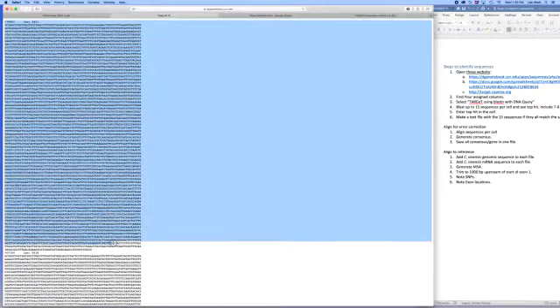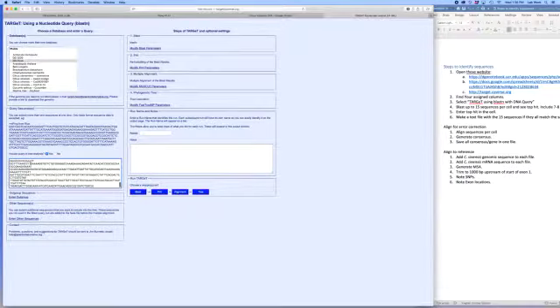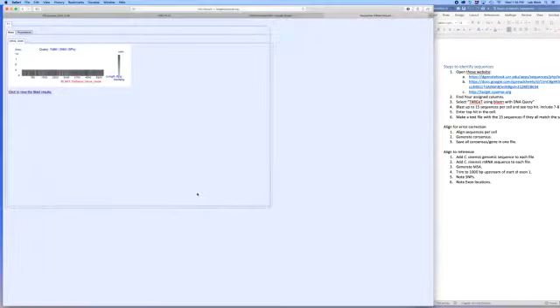And Target is something that I put together with a graduate student, and it does a whole bunch of stuff. We're just using it as a handy way to do a custom BLAST database and see what our sequence is. So you select the database up here, paste your query sequence down here, and just go to BLAST. Don't worry about what the other options mean. And here we get our result.